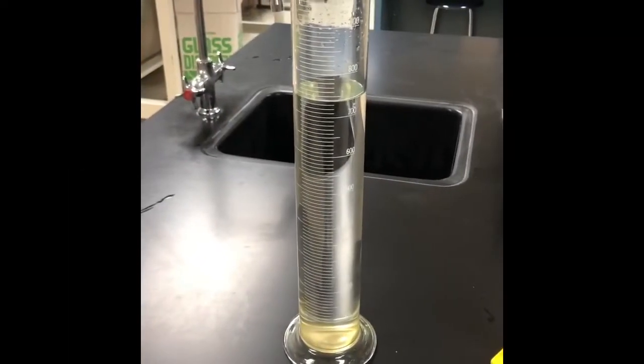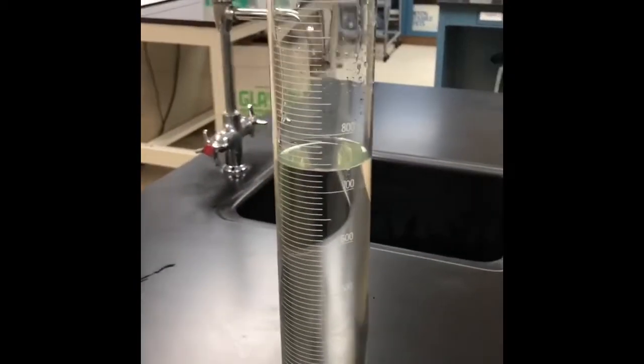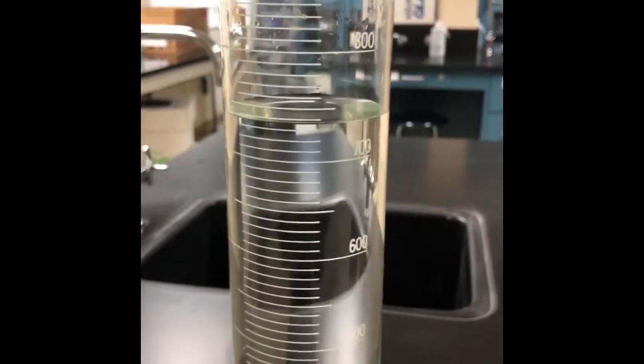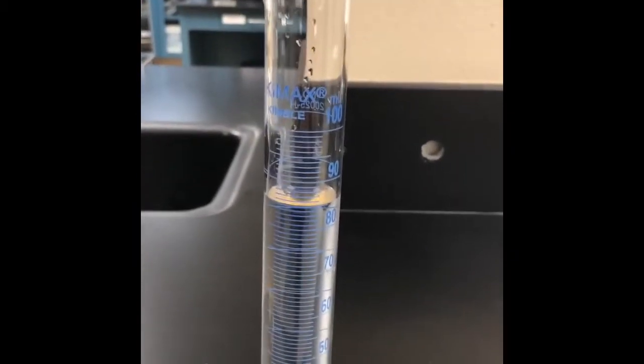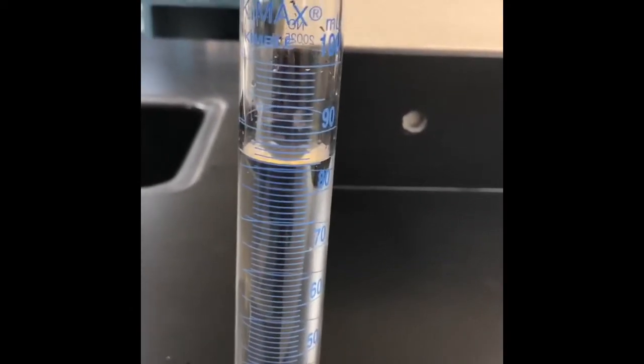We have four different size graduated cylinders. The 1,000 mL graduated cylinder has big markings every 100 mL and little markings every 10 mL. The 100 mL graduated cylinder has big markings every 10 mL, and each individual tick is going to be one milliliter.